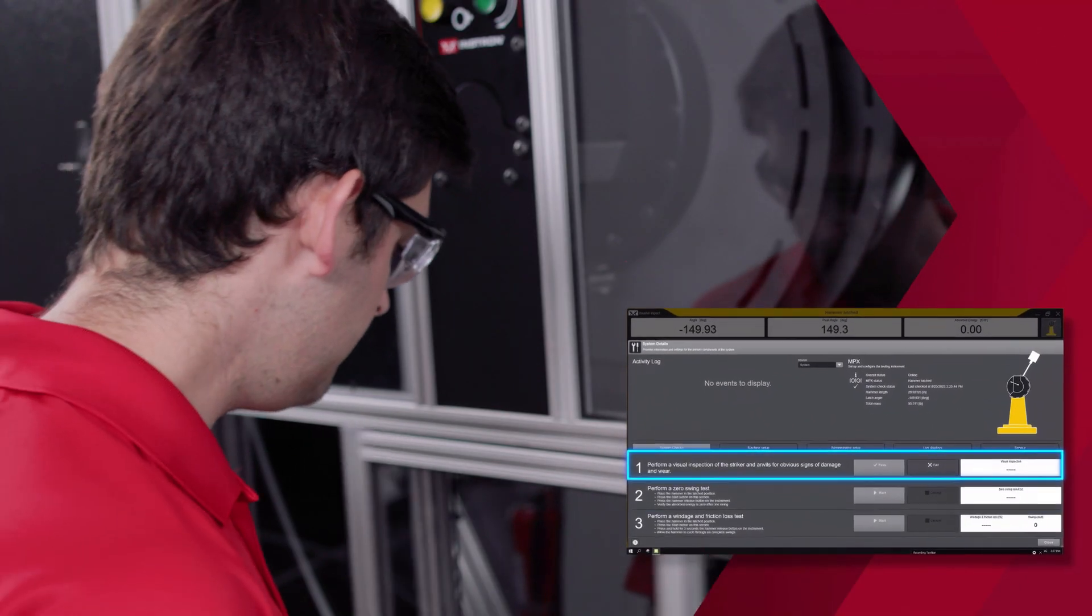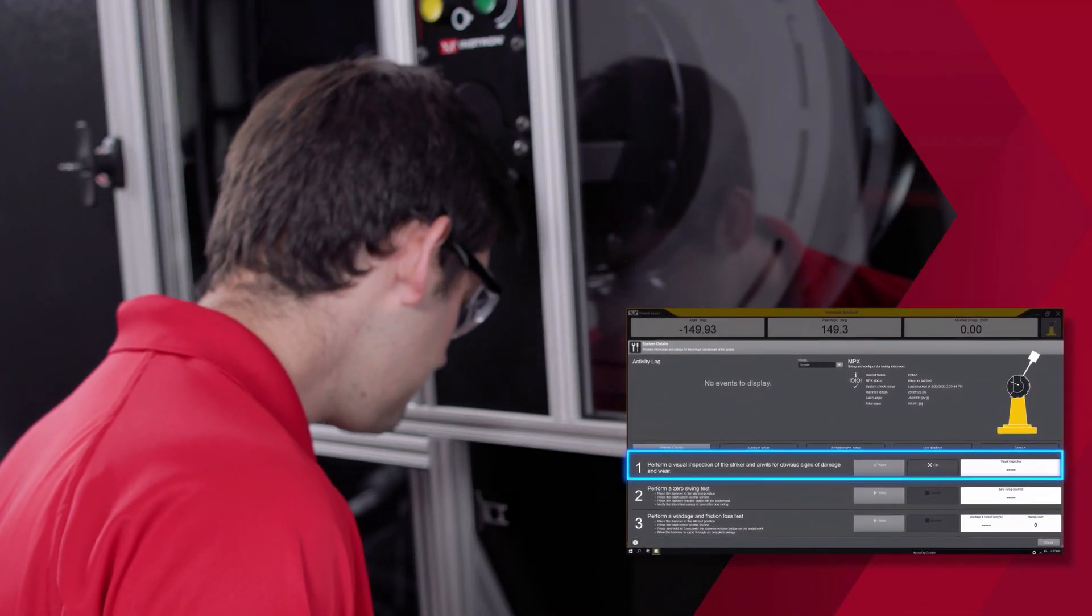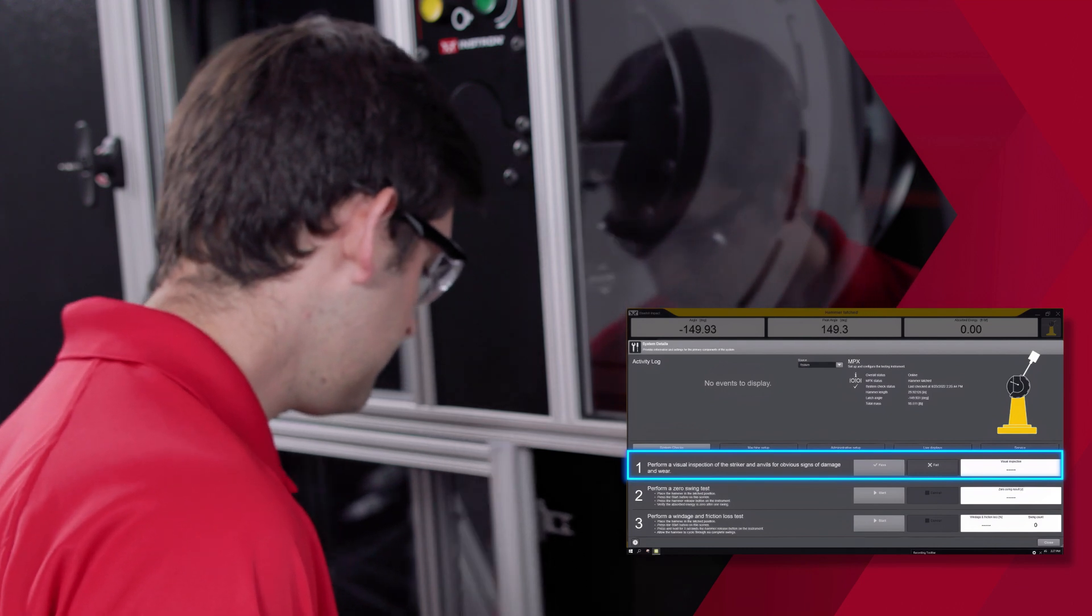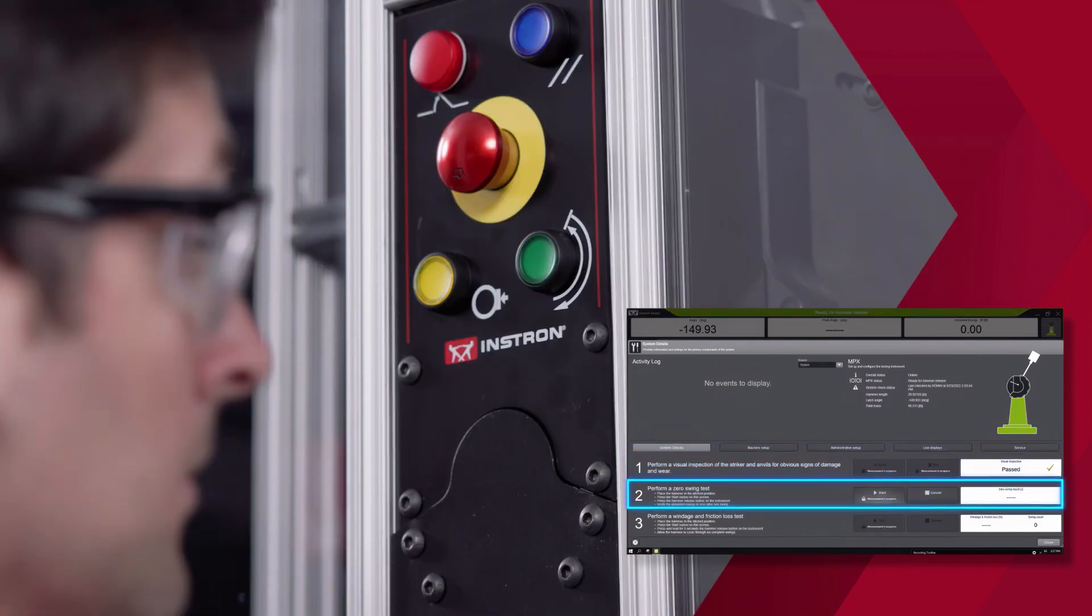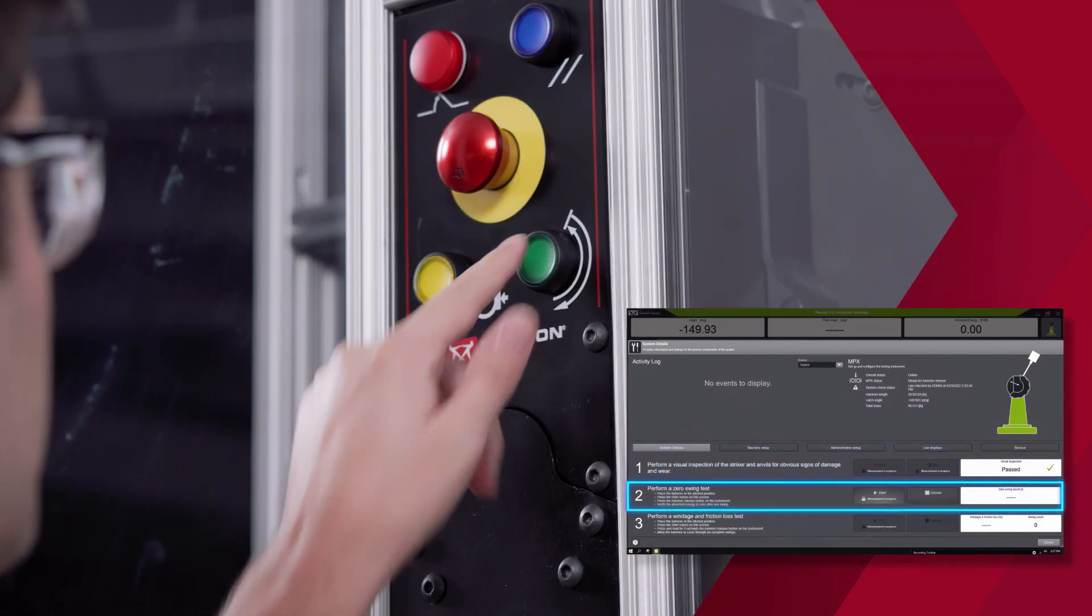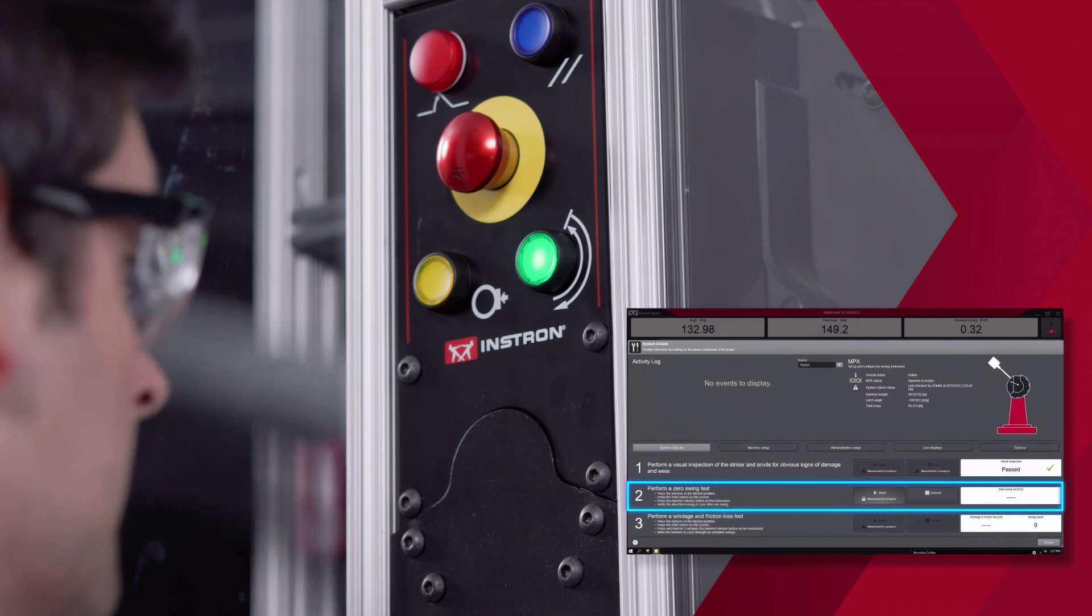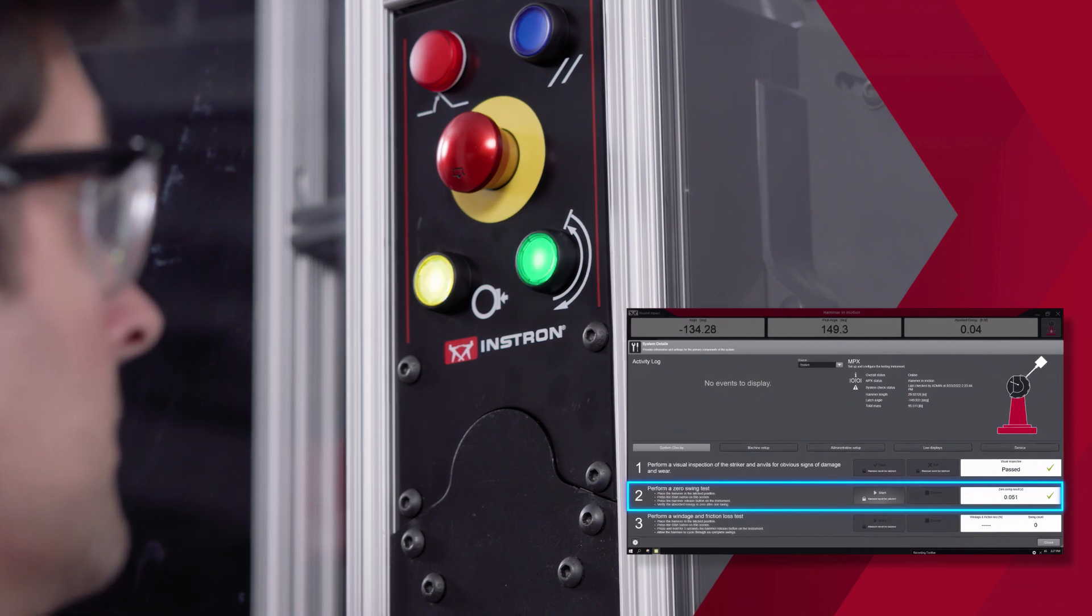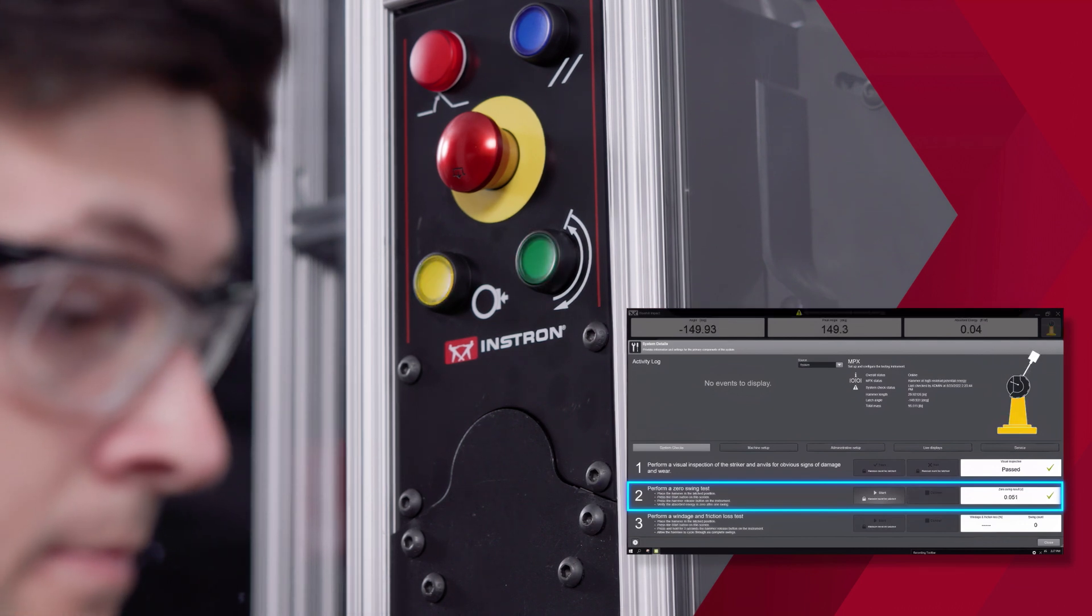The first step is a visual inspection of the striker and anvils to look for any obvious signs of damage or wear. Step two is to perform a zero swing test from the latch position to verify the absorbed energy is zero after one swing.